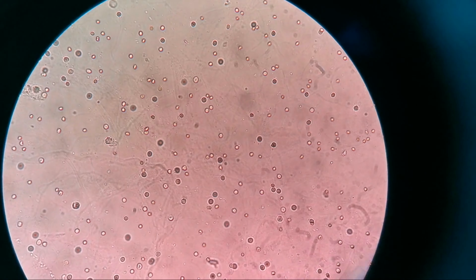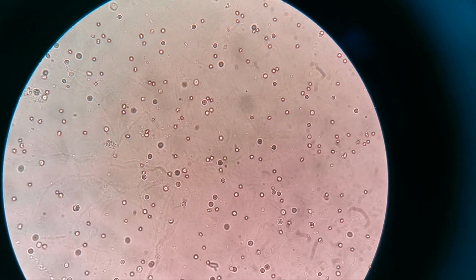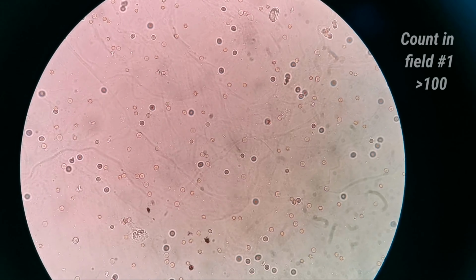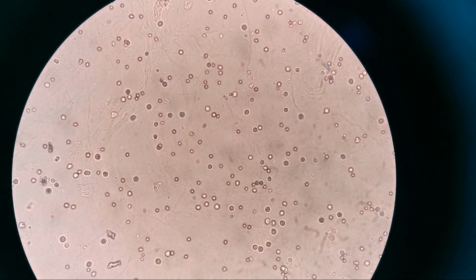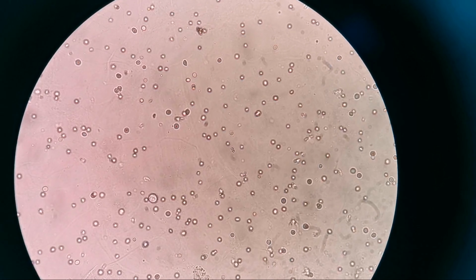Aside from the 100 RBCs that I enclosed, there are still RBCs that are not enclosed. Thereby my reading for this field is more than 100. In the first field I counted more than 100 RBCs. Now let's go to the second field and count. I also counted more than 100 RBCs on the second field. Continue counting till you finish 10 fields.